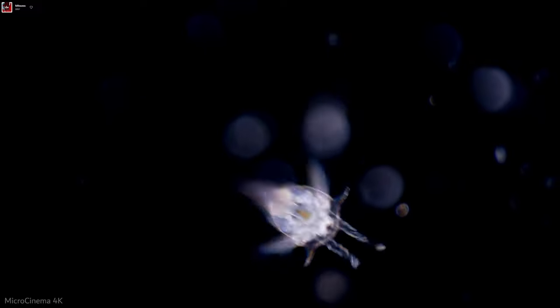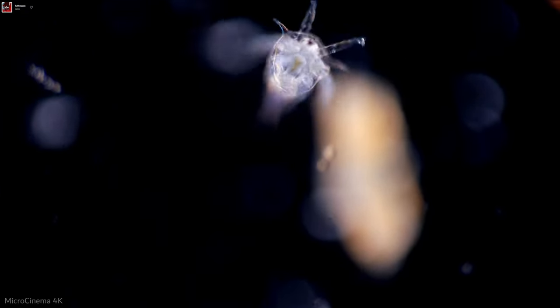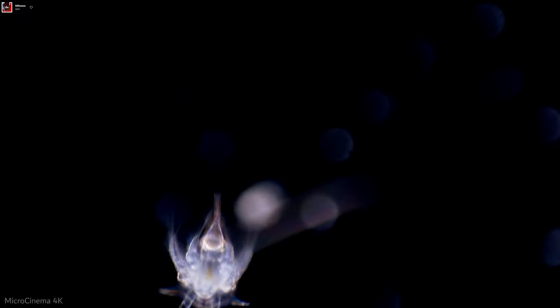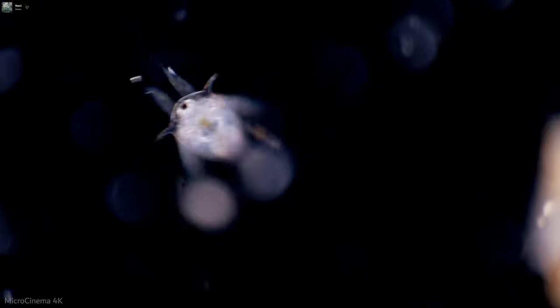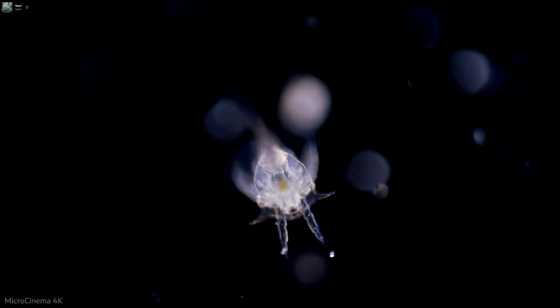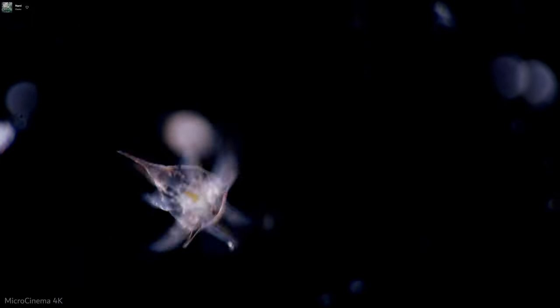Yeah, my theory is that, what I normally do when I prepare slides for all of you is I'll make a petri dish with some sample from my jar, and then over time, sometimes half an hour, 45 minutes, I'll spend time in my stereoscope pipetting up individual little organisms that I want to have on the slide. And I'll just start spitting out little microliter-sized droplets onto the slide or into the well.